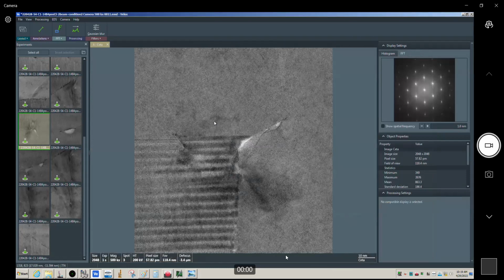All right, let me go back to my list here. I'm going to check these off so I don't do them again. Got that one. Interpolation. Measuring beam current. Data bar versus scale bar.